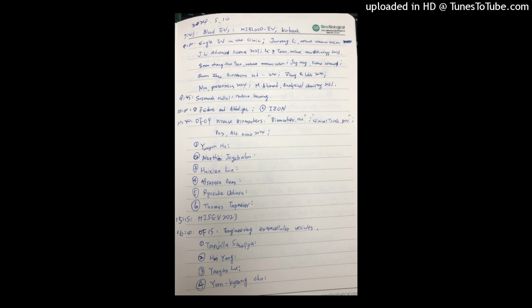So we want to characterize 2 proteins simultaneously in one sample at a single particle level. Let's take EpCAM and HER2, this combination, for example. After subtyping, we could get more information, because there are the concentrations of EpCAM positive EVs, or HER2 positive EVs, or the unweighted sum, and the concentrations of each subpopulation in Q2 or Q4.